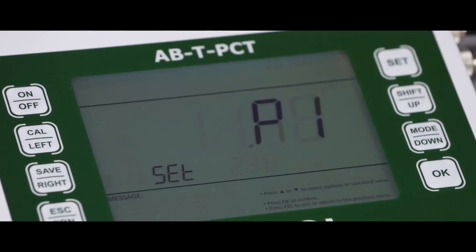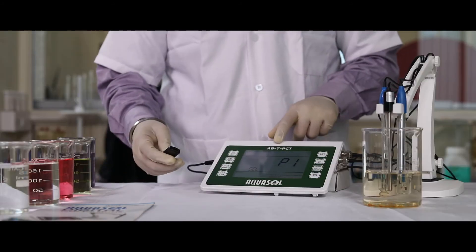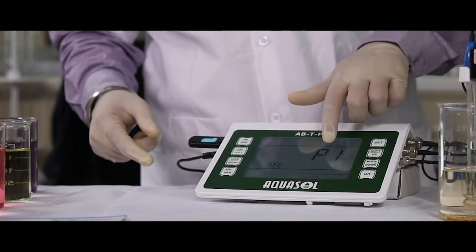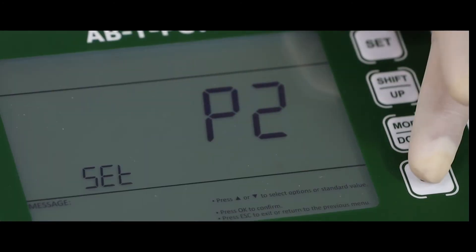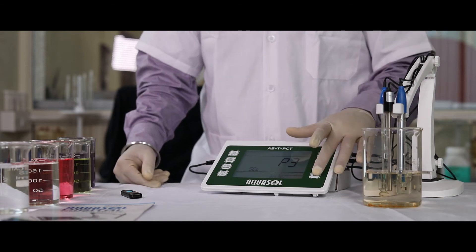Settings. To enter settings, press Set key. P1 to transfer the data to pen drive. P2 to set date and time. P3 to clear all data.